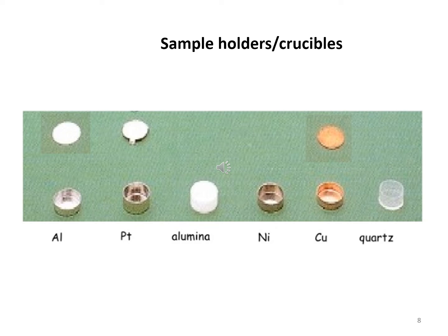When you are putting your sample in the pan, avoid overfilling the pan so that you can get good results, and the material cannot overflow from the pan. Mostly small sample masses are taken, and we analyze our sample at low heating rates, which can increase the resolution.